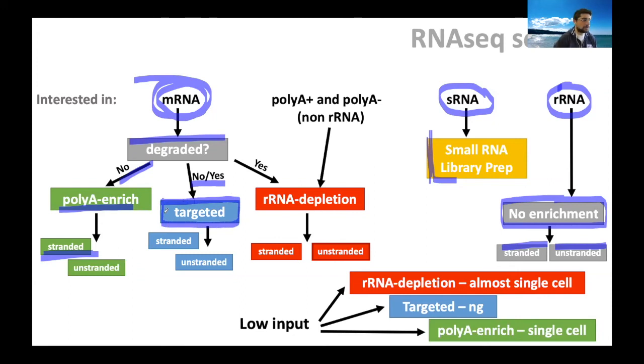The exome sequencing that you know usually starts from genomic DNA, but you can perform a similar type of approach on RNA. Or if you're not interested in the entire transcriptome, maybe you're interested only in genes that you know are overexpressed in a particular type of cancer. You may have a breast cancer panel. You might have a colorectal cancer panel, and please do the stranded preparation. Okay. This is saving you money for the sequencing, though it is more expensive for the library preparation when I'm talking about the targeted approach. Is your sample degraded?